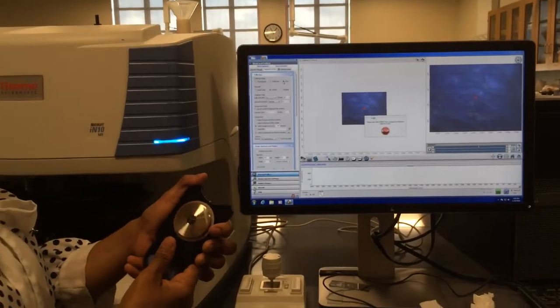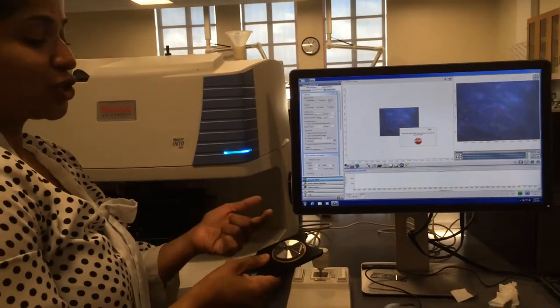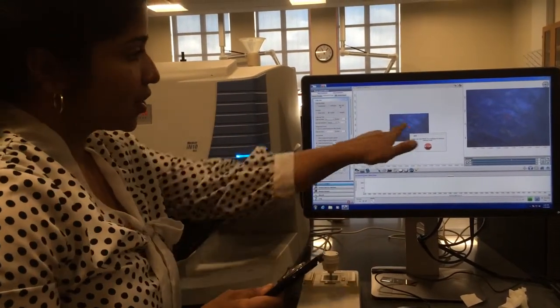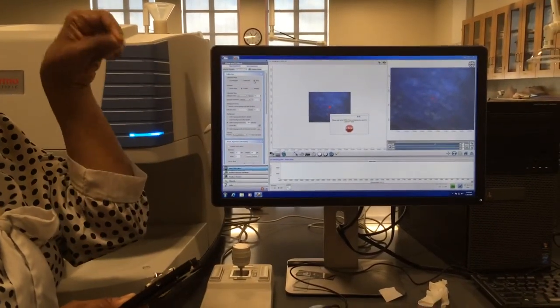I will insert the ATR. It will do a background on the crystal by itself, which is just a germanium clean crystal. Then the ATR will make contact to that particular point and then collect a spectrum right up from that.